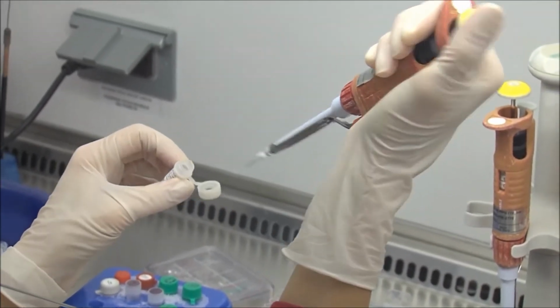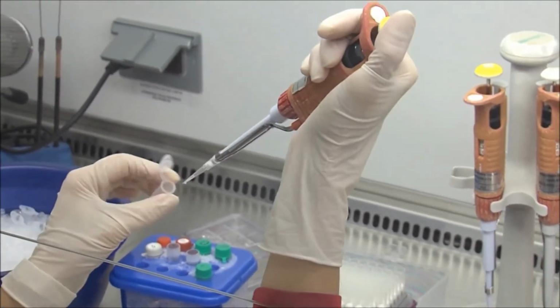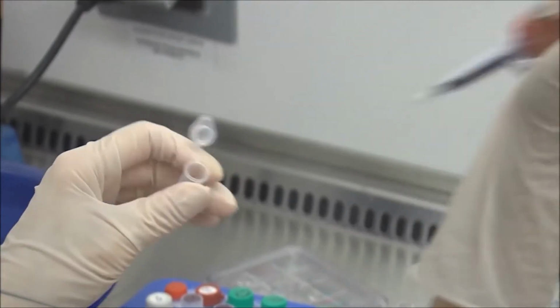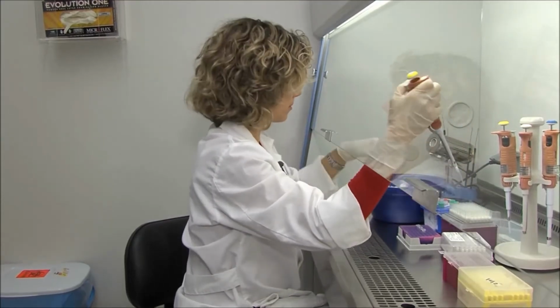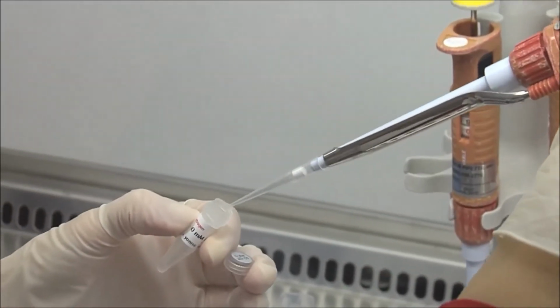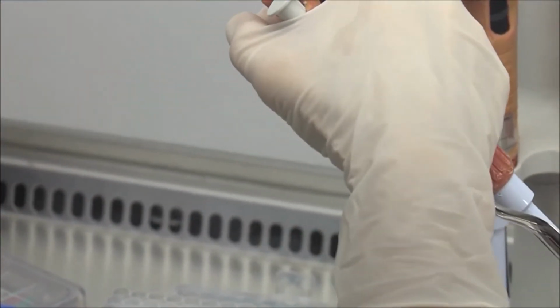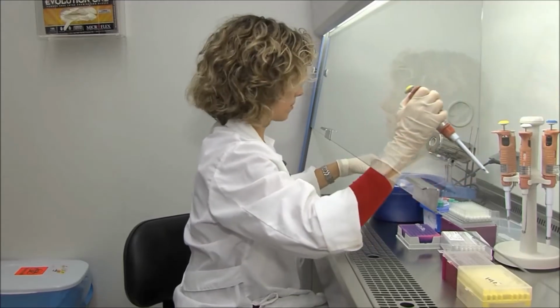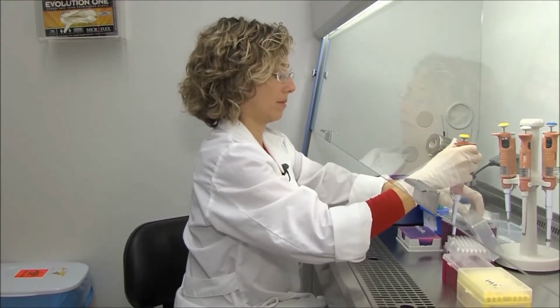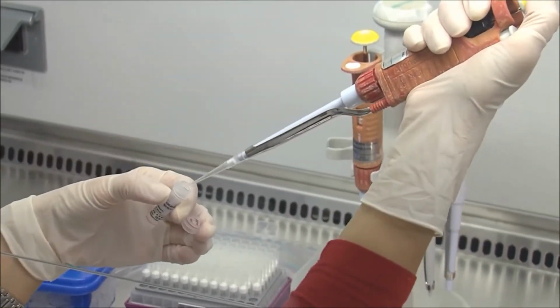This is the buffer for the Taq polymerase. This is the magnesium chloride. Magnesium. This is one of the primers.